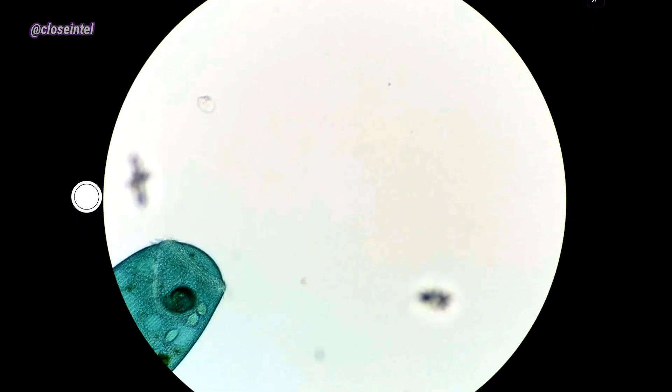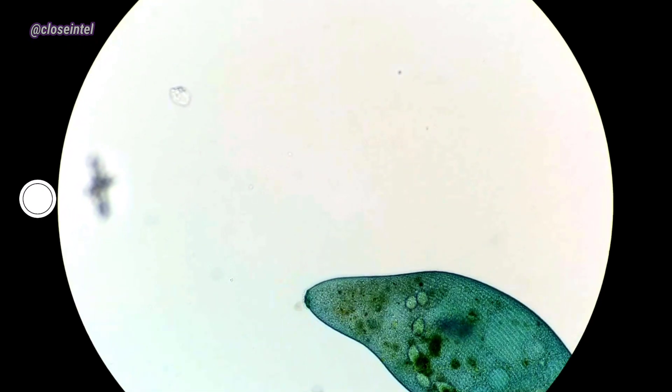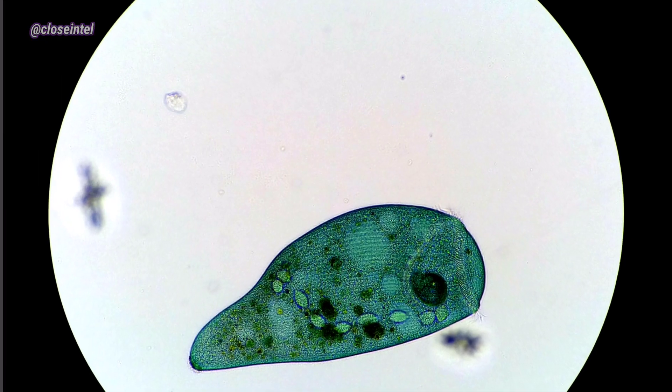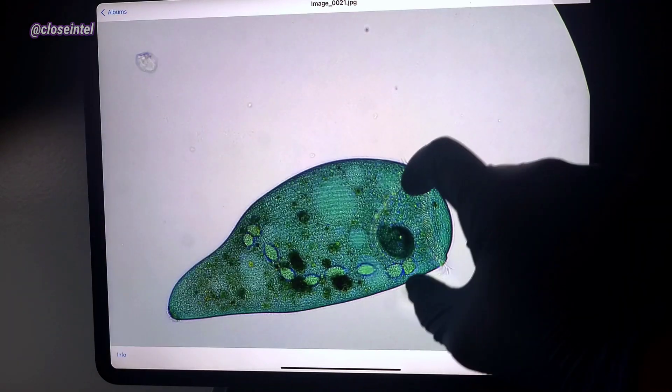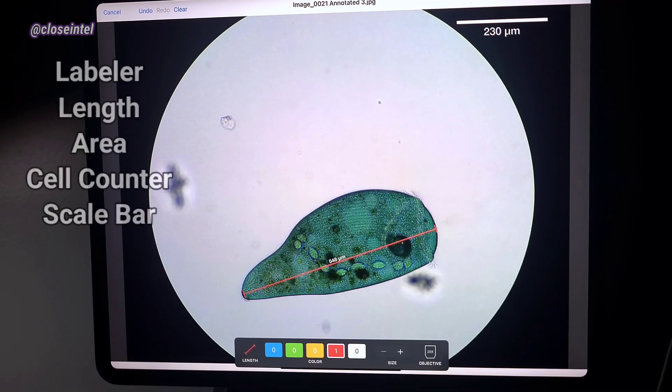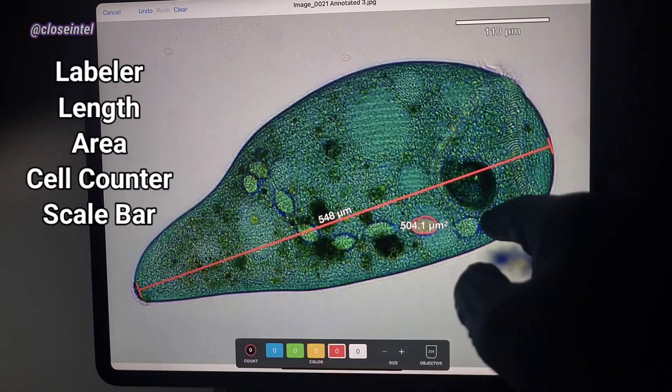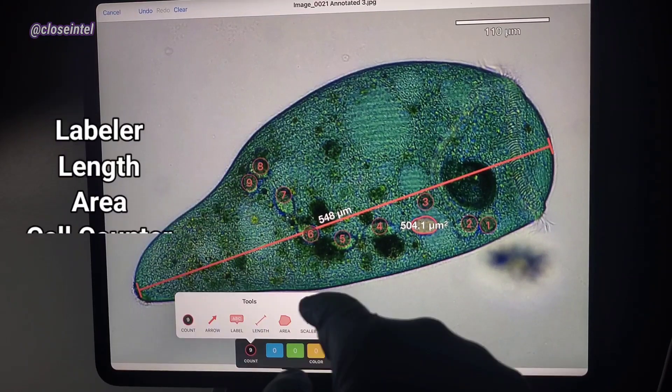Now I'm going to show you some of the software capabilities this microscope provides. I'll use some of these images of this stentor coeruleus to show off some of the software capabilities in the gallery. At the bottom left of the screen you can see that I can choose between length, area, cell count, and a scale bar. As you can see the length of the stentor is around 500 microns or 0.5 millimeters.